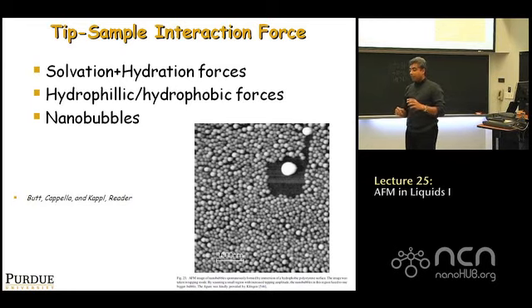And there are two components to these forces. There is one called an exponential component. As you come close, there are models that suggest that this hydration force would have an exponential profile: as you come closer, you need exponentially larger force until a certain point where you've removed all the water and you're in contact with the solid. Yet another group of people points out that this interaction force is not purely exponential, but actually has oscillatory fluctuations superposed on an exponential backbone.